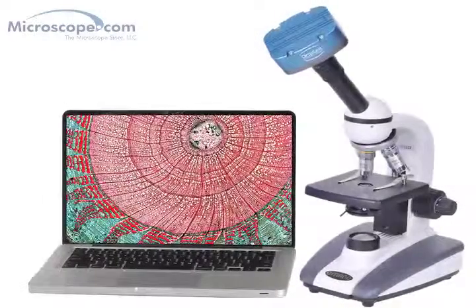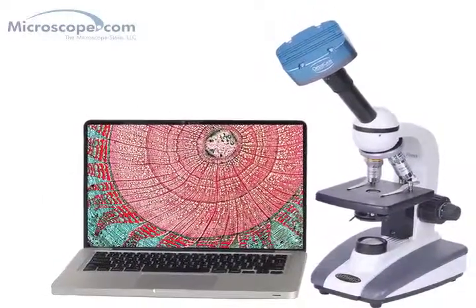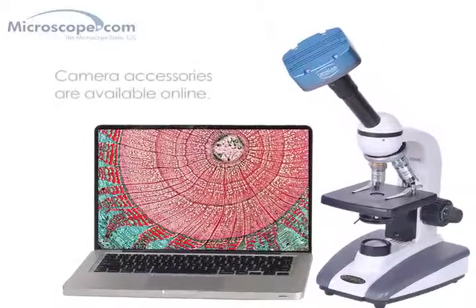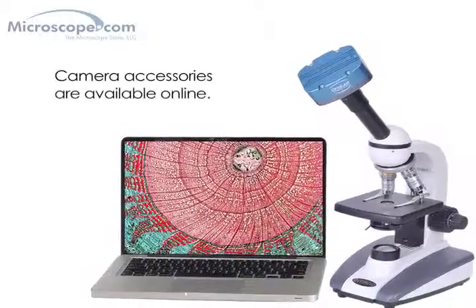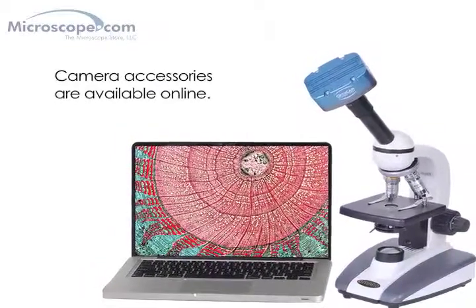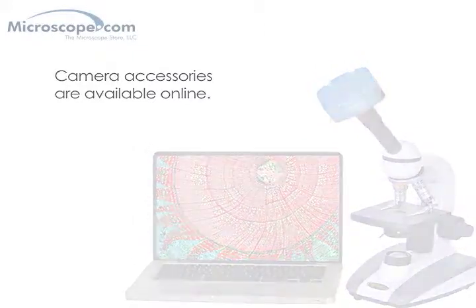Like almost all of our microscopes, this system is compatible with a full range of digital microscope cameras, which are available separately on our website. A camera can be attached by removing the eyepiece and inserting the camera in its place. This will provide an on-screen live view of the specimen and the ability to capture images for later use.